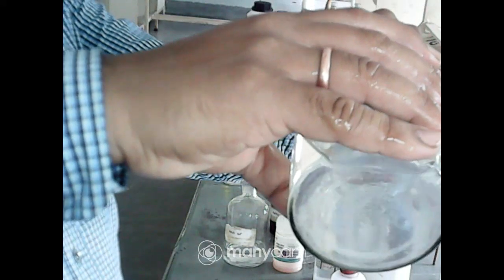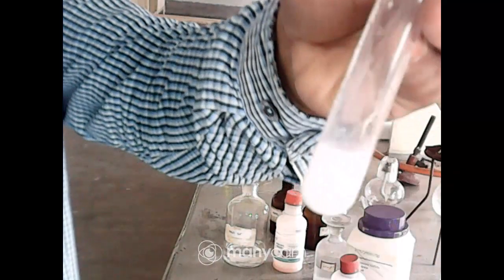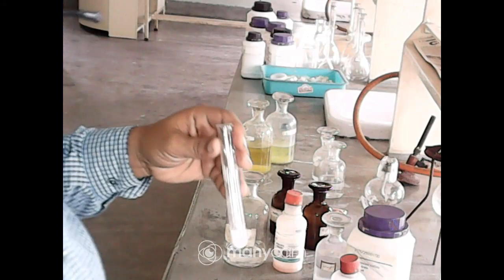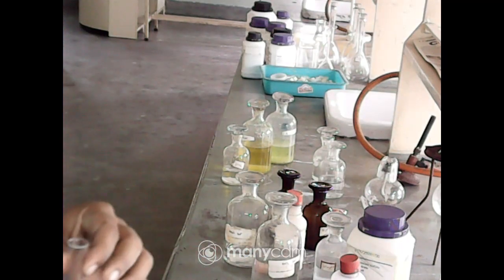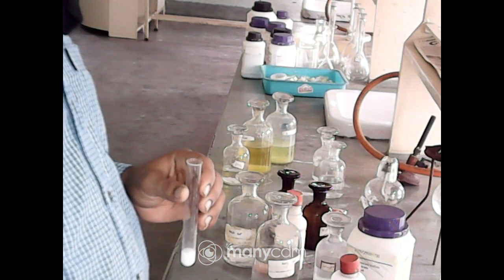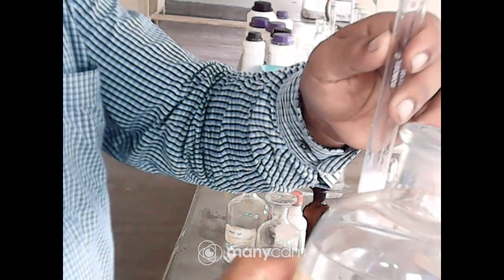Add it. If sulfate is present, a white PPT will appear. Okay, look at this. A white PPT is there. Now I told you that you have to be confirmed about that. Now add any dilute mineral acid, that is HCl or H2SO4. It is available here. So this is dilute HCl.